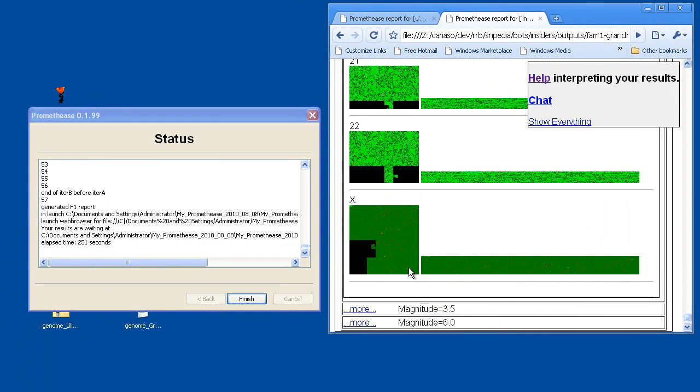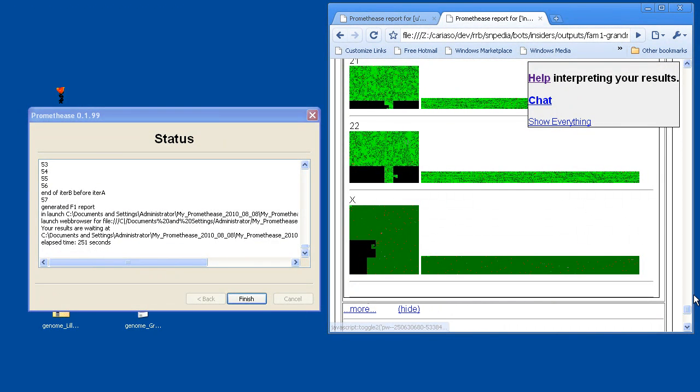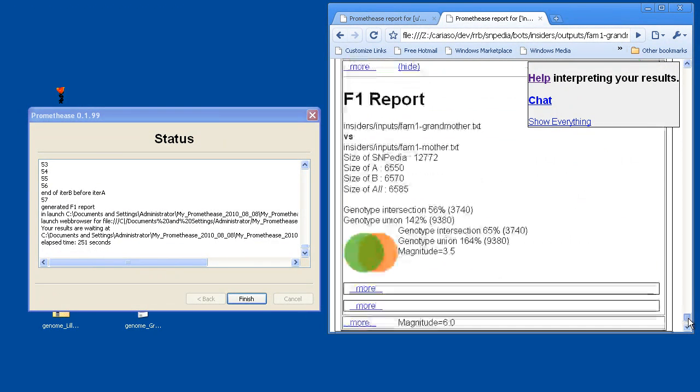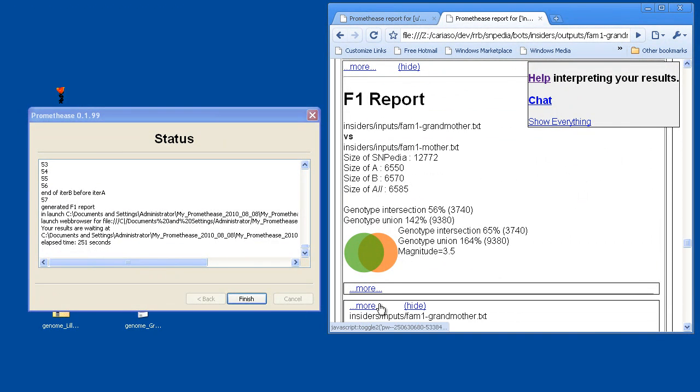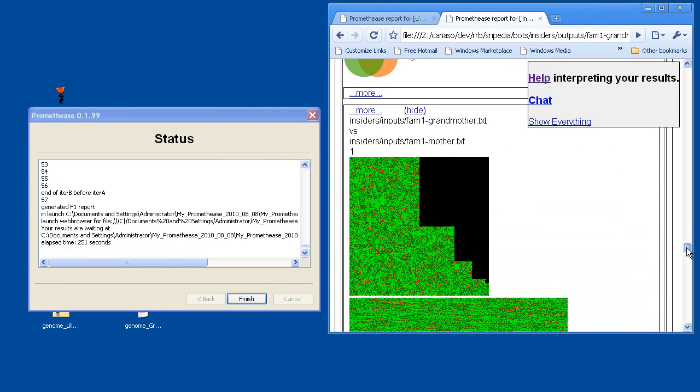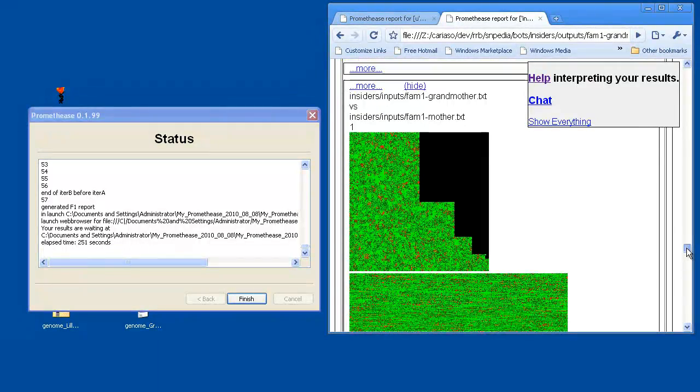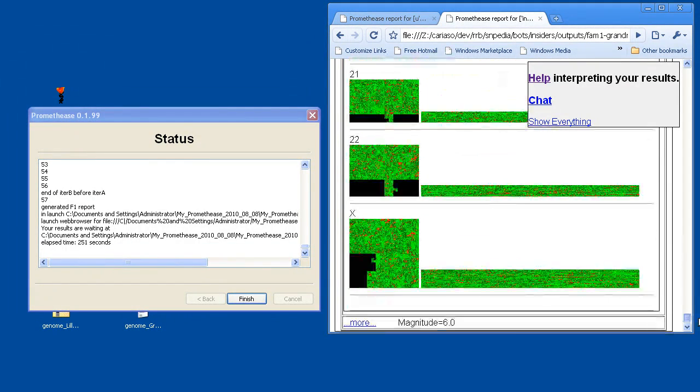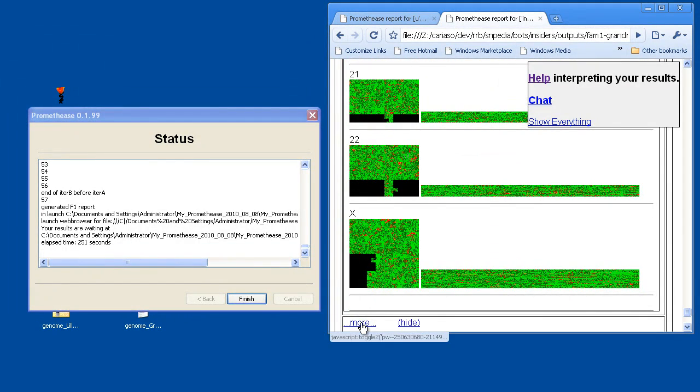You'll notice on the X chromosome, it's a different look due to the son only having one X chromosome, the grandmother having two. And then expanding now, the relationship between the grandmother and her daughter-in-law. Again, a sprinkling of red. There's no strong family-relatedness here.